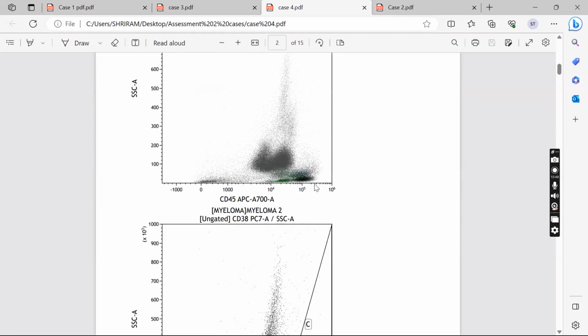Okay, so same things. 117 is positive, 81 is down regulated, and finally this is the plot which will confirm whether it is abnormal or normal. So when I get the blue color population which did not express any abnormal myeloma associated phenotype, it splits into 2 in kappa lambda, and the ratio is quite well preserved, which is 62% kappa and 36% lambda.